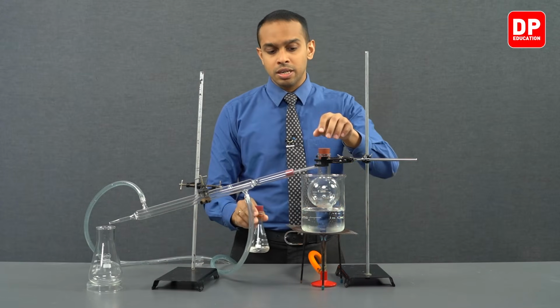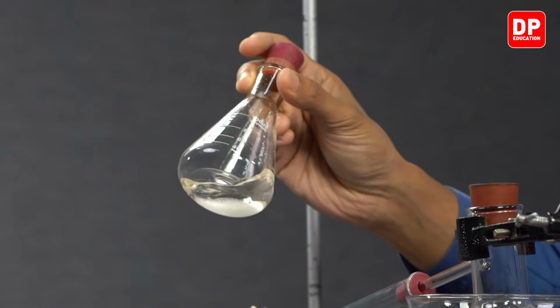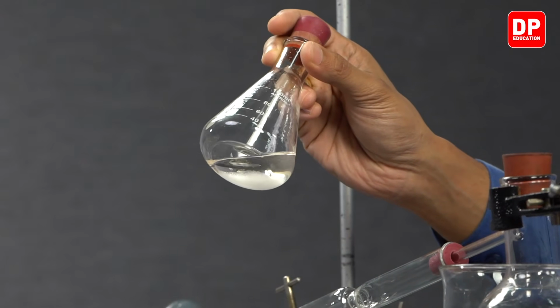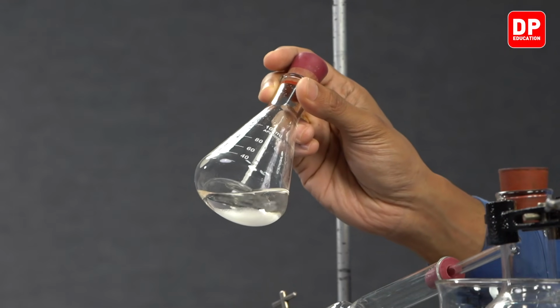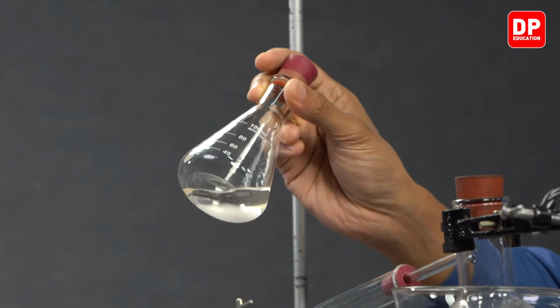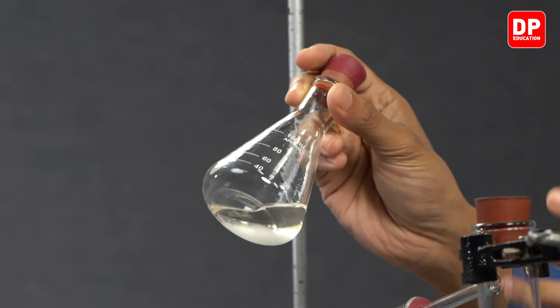So to this distilling flask we are going to be adding our diethyl ether layer that we extracted from the solvent extraction process. So this diethyl ether has now the essential oil dissolved in it.